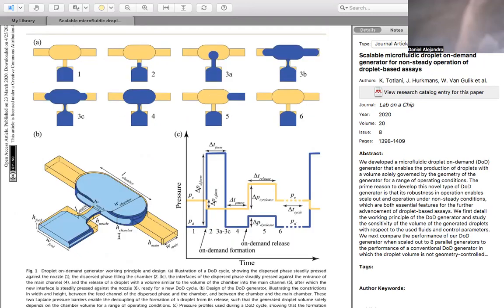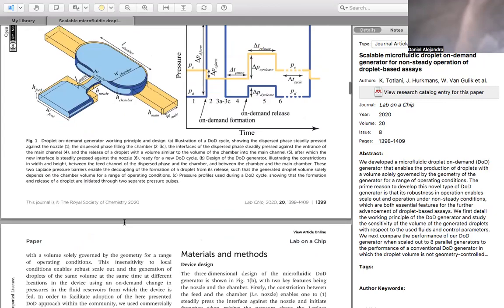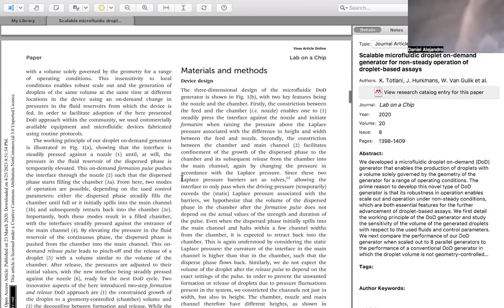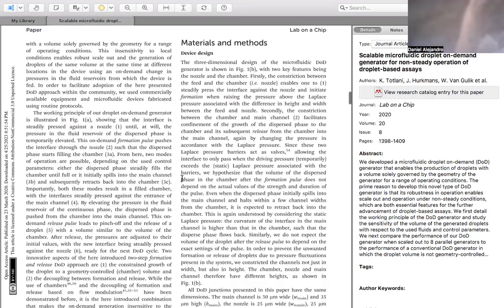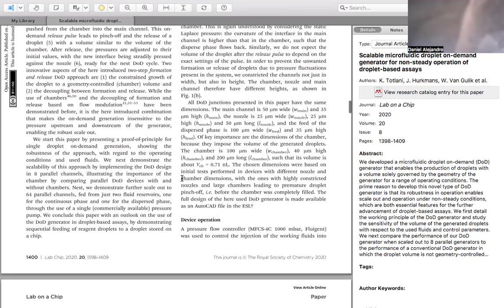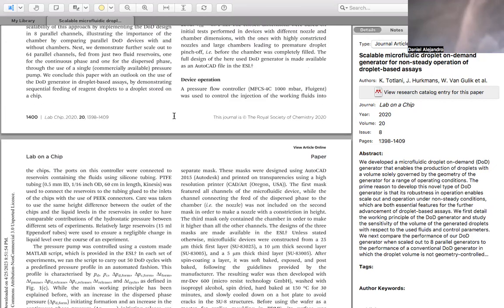It's simple, the application of this design, but the problem with the compression that we use with the flex is that it has three layers. So, to explain that in materials and methods, the device design is made with the same programs. And what's the difference? At first, it's the device operation.